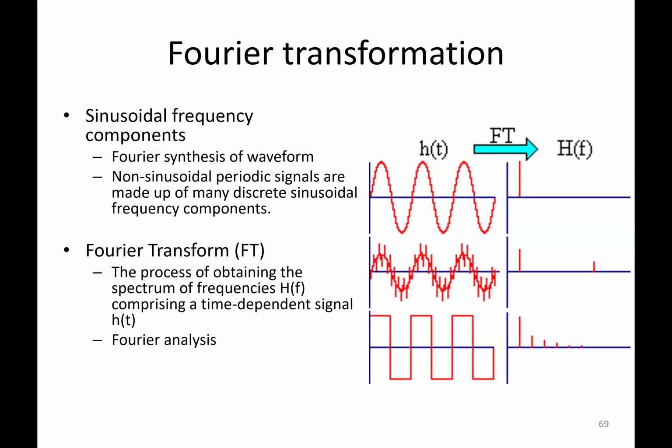Now, the same thing here. You might see a noisy spectra. You use filters, more or less like that, but then you transform it, FT. It might have two peaks. That's what we see, like NMR. Okay? So again, it might be in this form. If it's a square wave, then you transform it, it may have several peaks. Does that make sense? So in other words, the one on the left-hand side is in the time domain, as you will see the wave, but then you put the filters, and it removes the noise, and then you get your real frequency in the frequency domain.